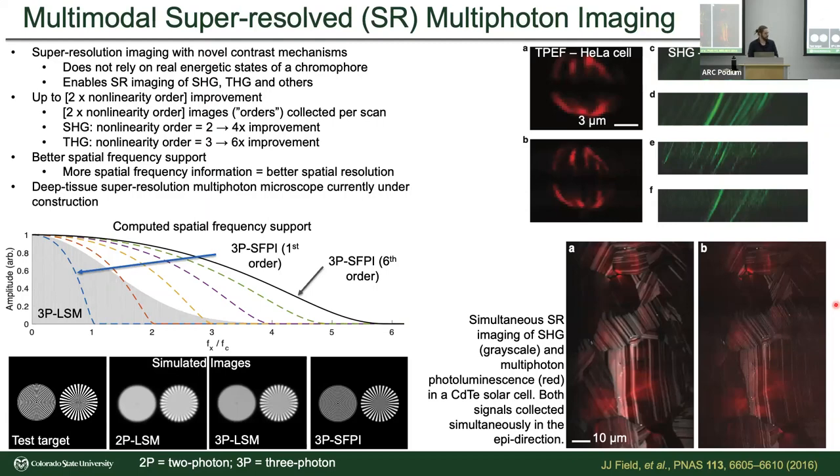So you could imagine, and let me see if I can drive to one of these slides quickly. You could imagine turning up the laser intensity as much as you want, right? If you had an infinite amount of laser intensity, you could imagine turning that up so that this exponential decay as a function of depth goes away. But at that point, you start to generate so much signal from the surface of the tissue that you corrupt your image. And I have an example slide.